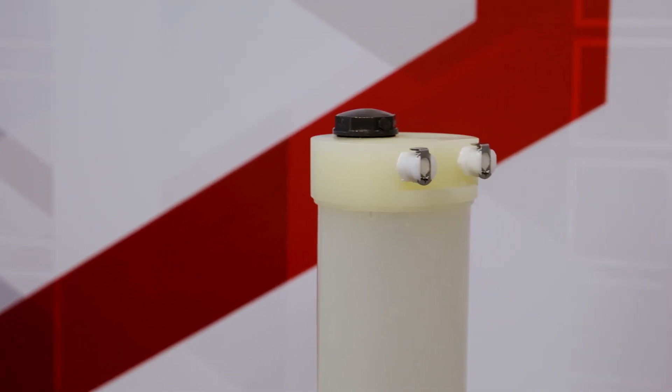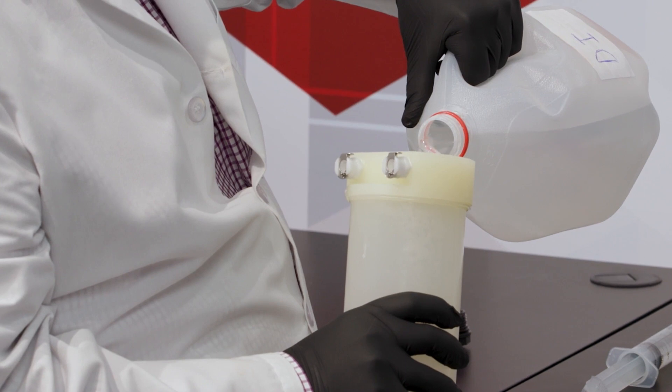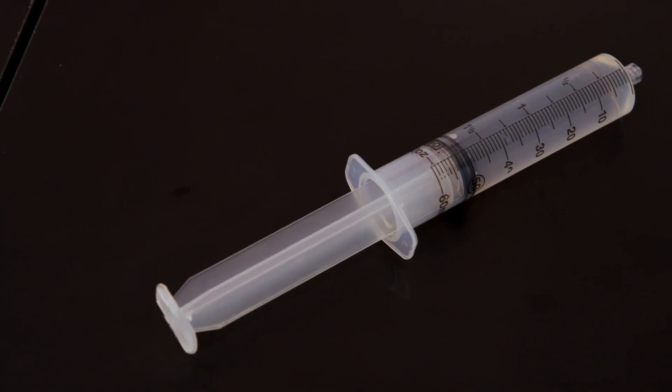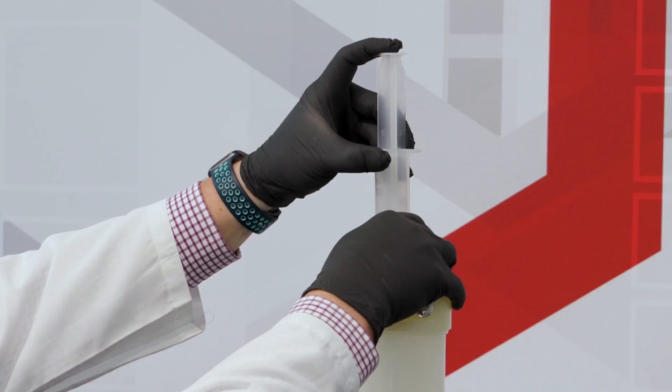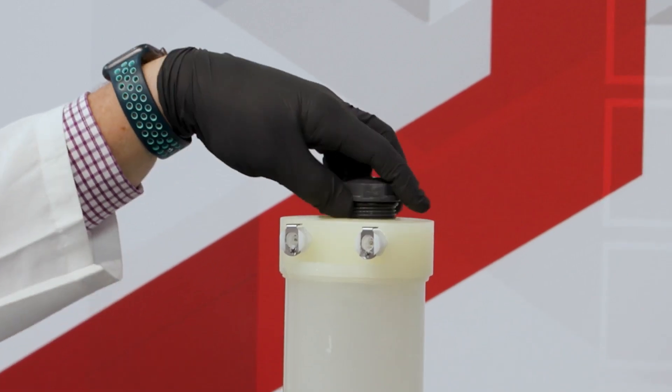Next, remove the cap on the top of the disinfection cartridge and fill the cartridge with deionized or distilled water. Inject the full contents of the CMX-25 cleaning syringe into the disinfection cartridge and reinstall the cap.